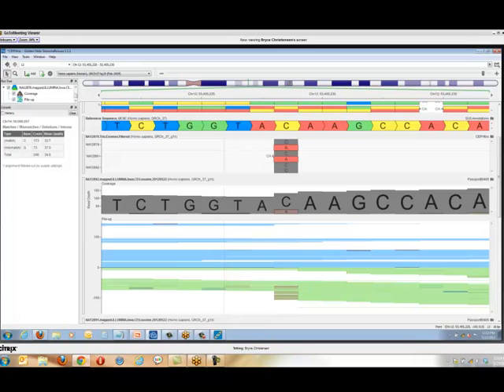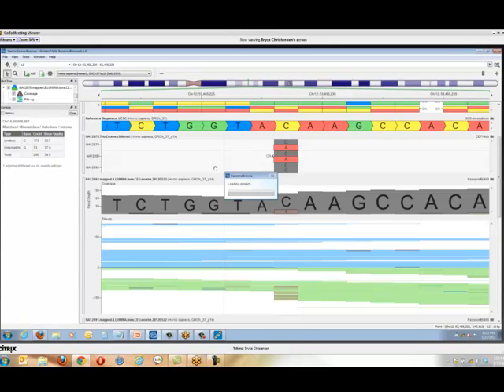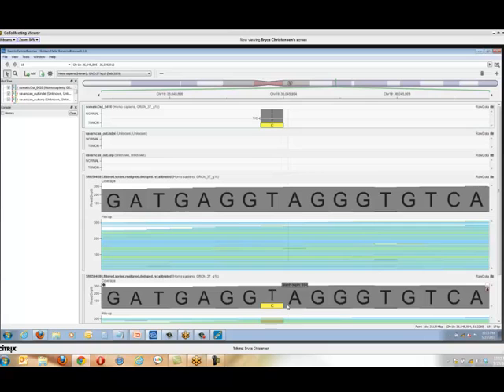Now, this next one will be the last one I show. I have a whole gallery of things that can go wrong, the rogues gallery, if you will. But what I want to show you is in a pair of cancer exomes, and unfortunately I'm zoomed in on the wrong place.